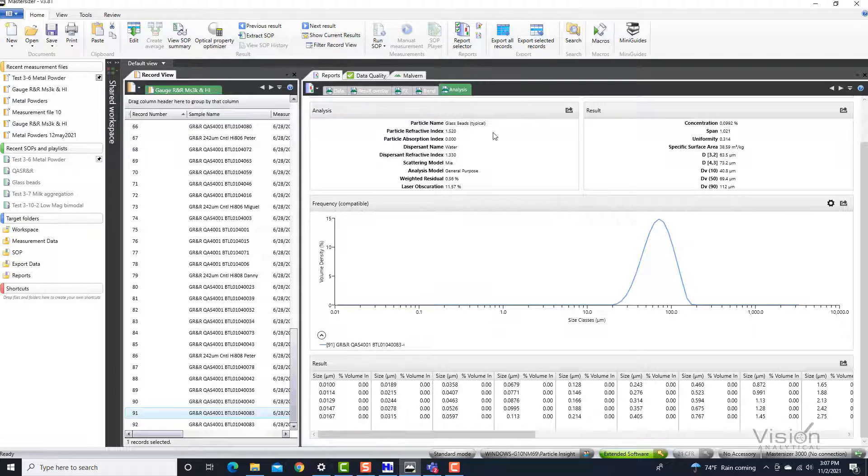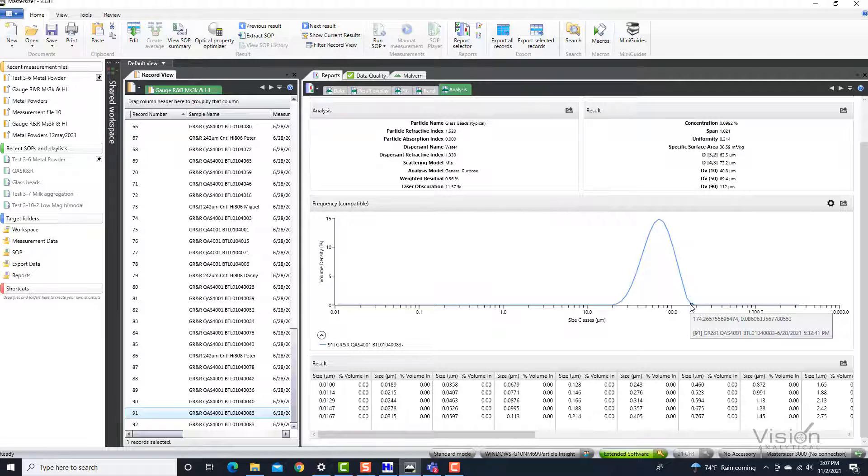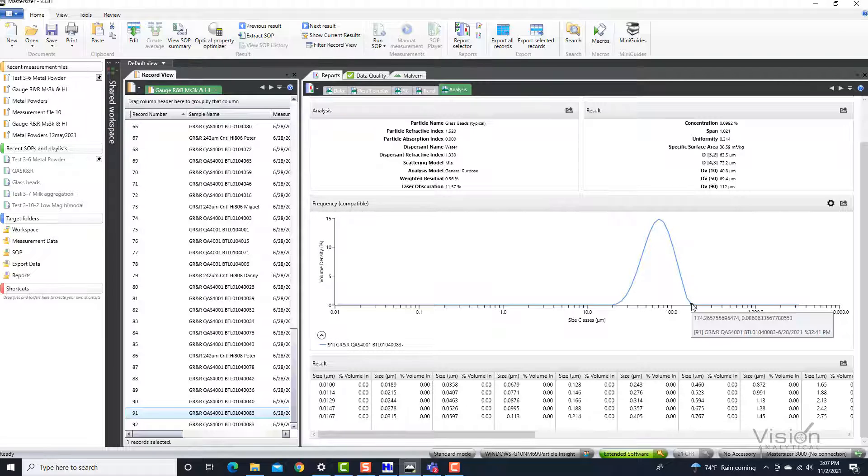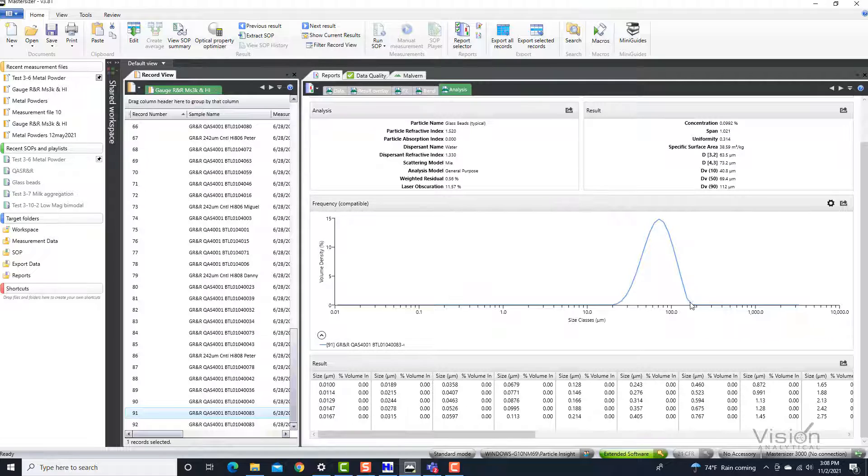So this sample was a glass bead. As we can tell, there is a D10, a D50, and a D90. The D90 goes up to about 112 microns. And what we are going to see is the objective evidence of the particles that were around this size range.